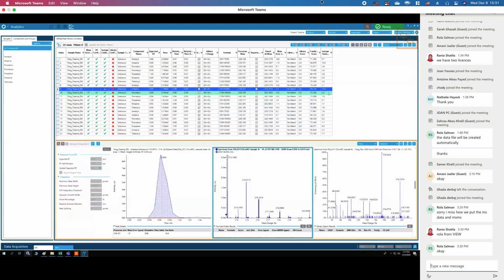Now you may think, okay, 15% is not very good. Well, look also at what's happening in this data. You have other masses here, and these other masses are contributing, especially here. See that the ratio should be that high, but it's actually a little bit higher. So that is why we have that 15%.